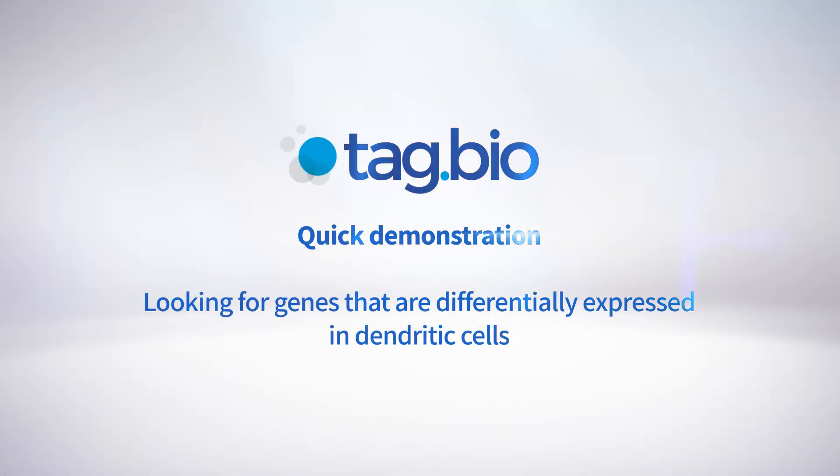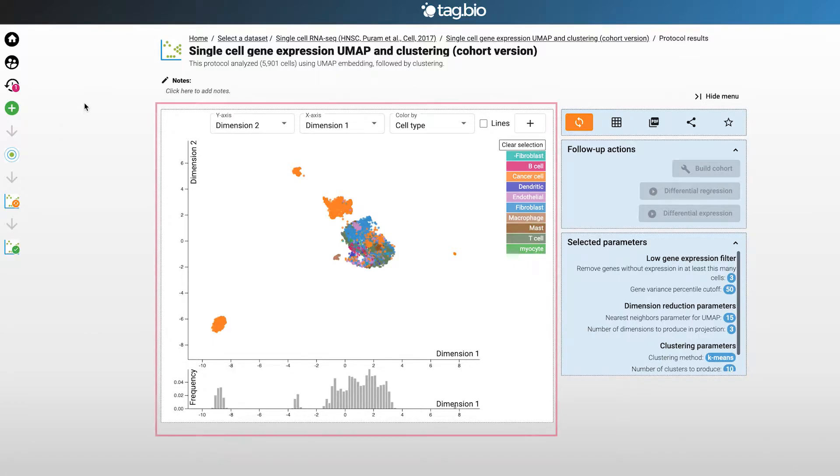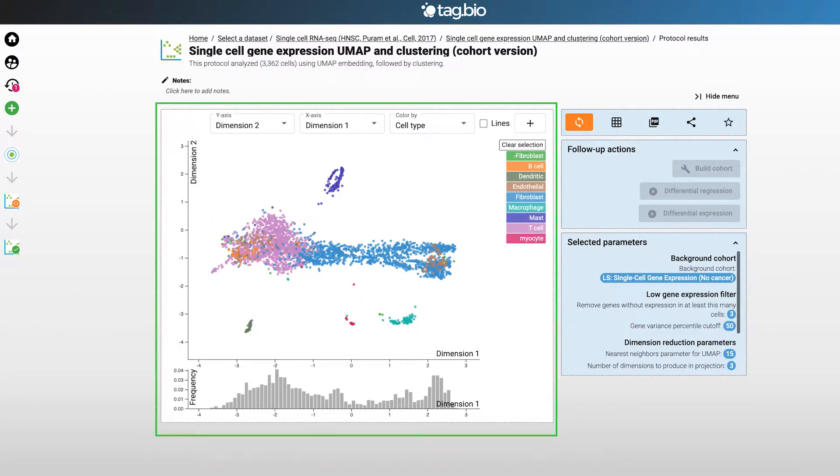In this demo we're going to look for genes that are differentially expressed in dendritic cells. To do this we will compare gene expression of two cohorts: one cohort which contains all cells including cancer, and another cohort with the cancer cells removed. Let's start from the beginning.